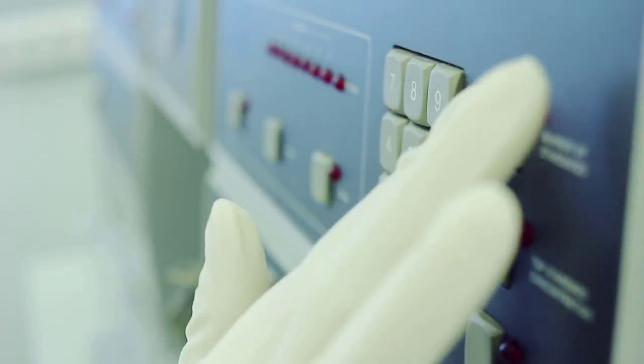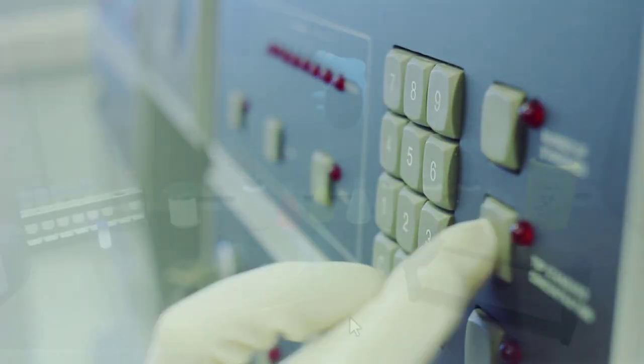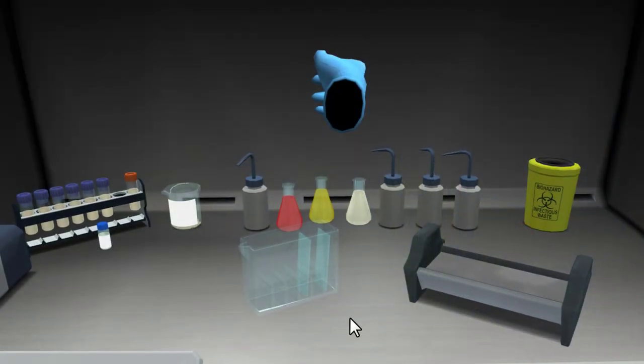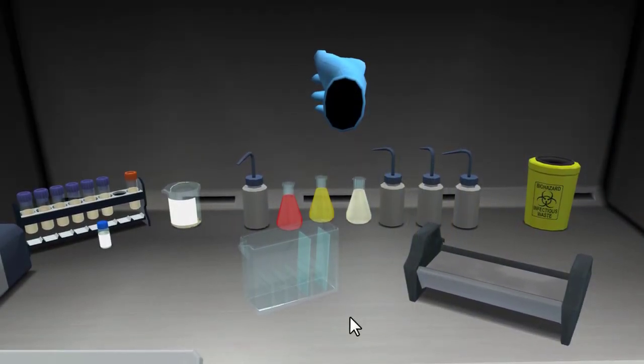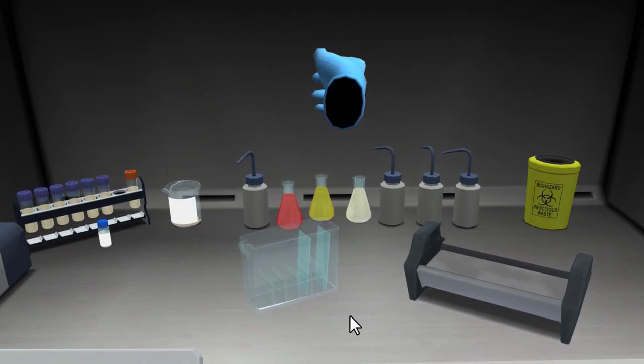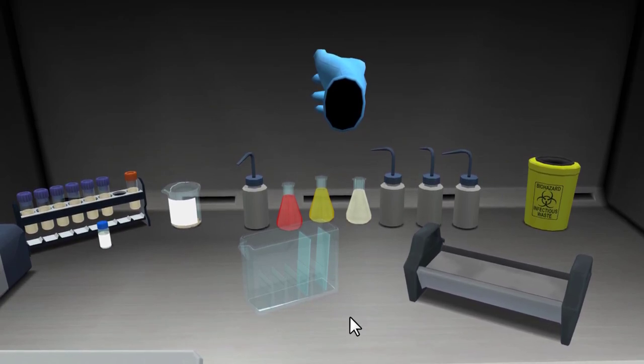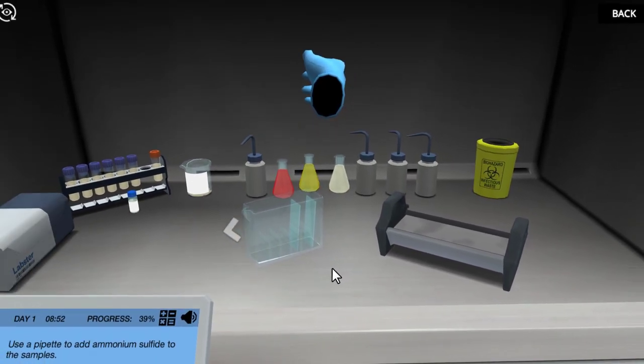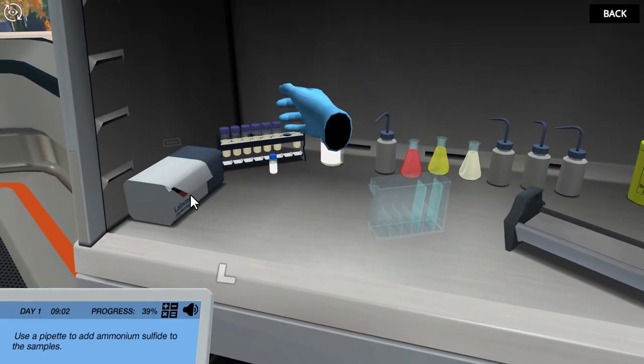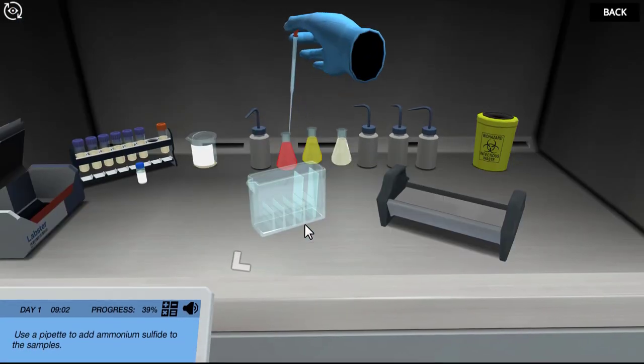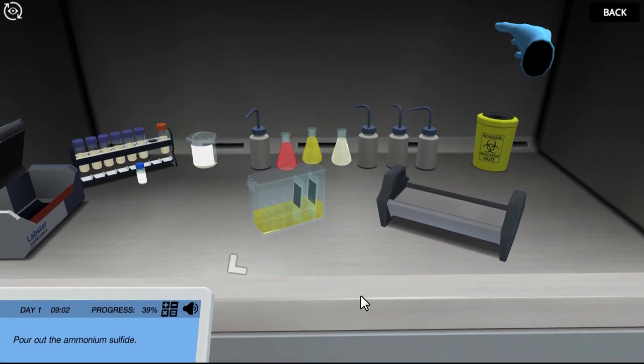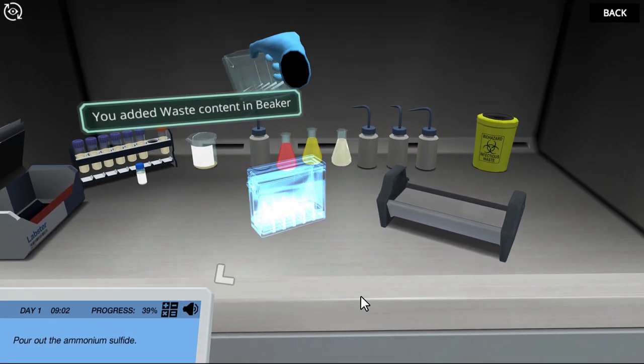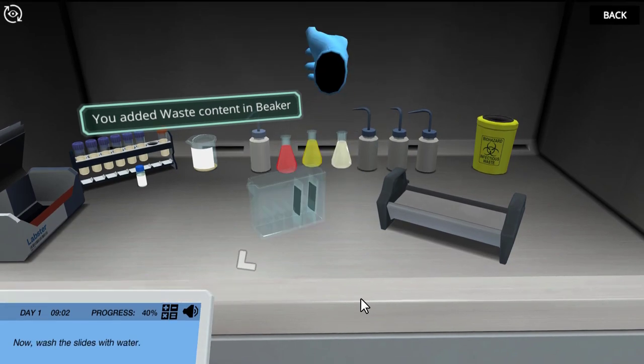I've finished the water washes for you. This next step is toxic, so I have turned on the fume hood for you. You can see a yellow solution of ammonium sulfide prepared for you. You need to add the solution to the jar for 20 to 30 seconds, after which the color will change. Then, wash it with water. You do it the first time, and I will do the remaining times. Use a pipette to add ammonium sulfide to the samples. Pour out the ammonium sulfide. Now, wash the slides with water.